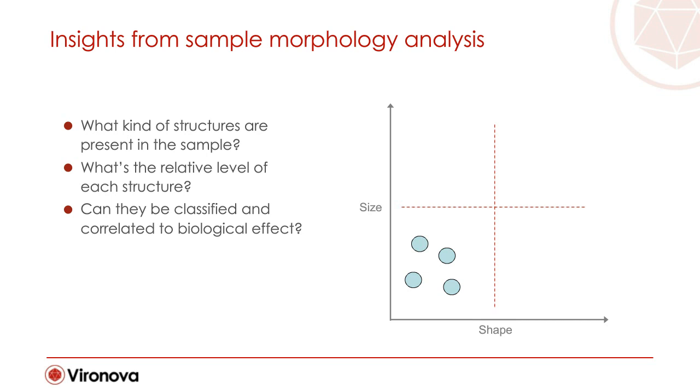There were also some larger structures with different shapes, but these seemed not to affect the efficacy nor the safety, so these structures were acceptable as long as their concentration was not too high. Then there were also some elongated structures with similar size as the small spherical particles.